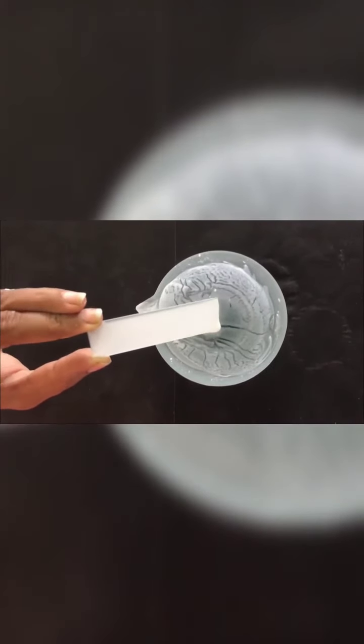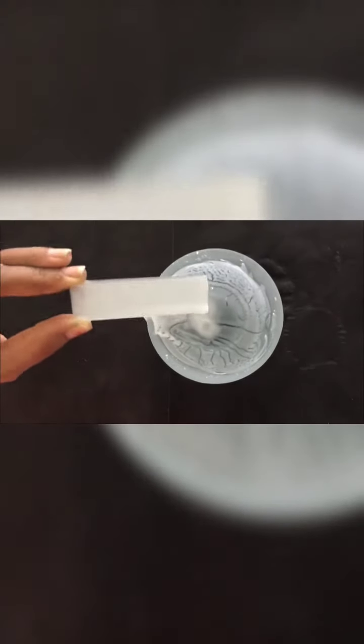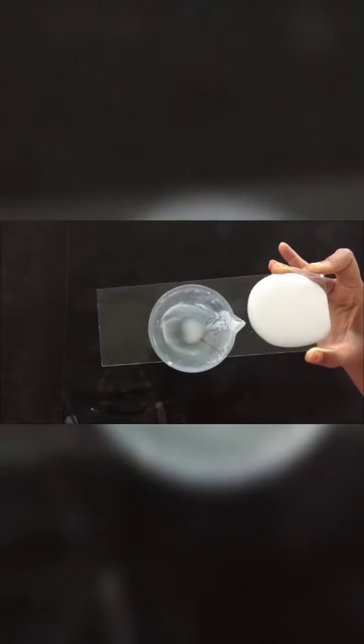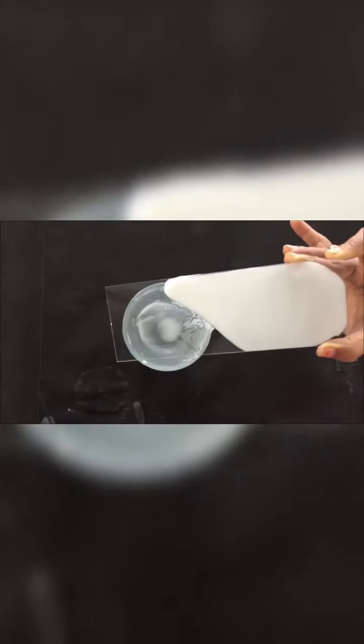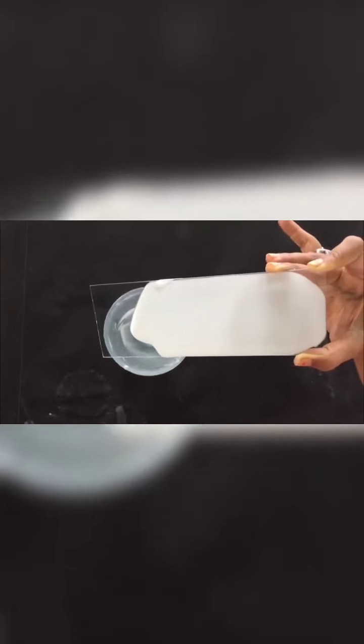Make sure that there should not be any uneven spot on the plate and remove the excess slurry over the plate. Similarly, you can follow the same procedure to coat the big size glass plate with the slurry. These TLC plates can be used for analytical study. It is used to identify the components of a mixture and also to check the purity of the sample.